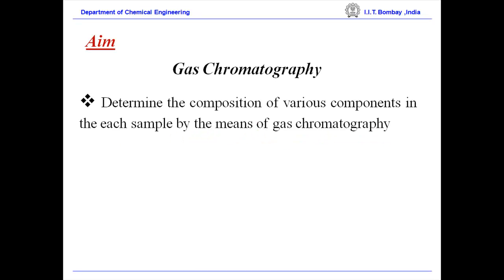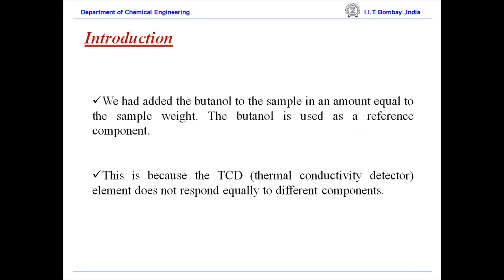The aim of the experiment is to determine the composition of various components in each sample by means of gas chromatography. Introduction and theory. Introduction.